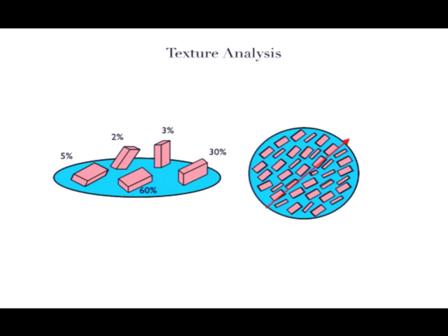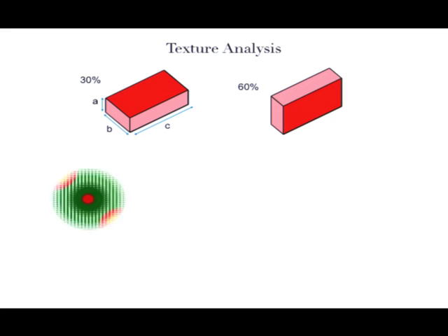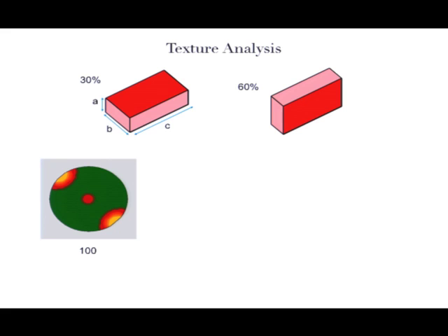If I now just look at the two major orientations, and let's say look at the reflection from the 100 phase, I will get a measurement.